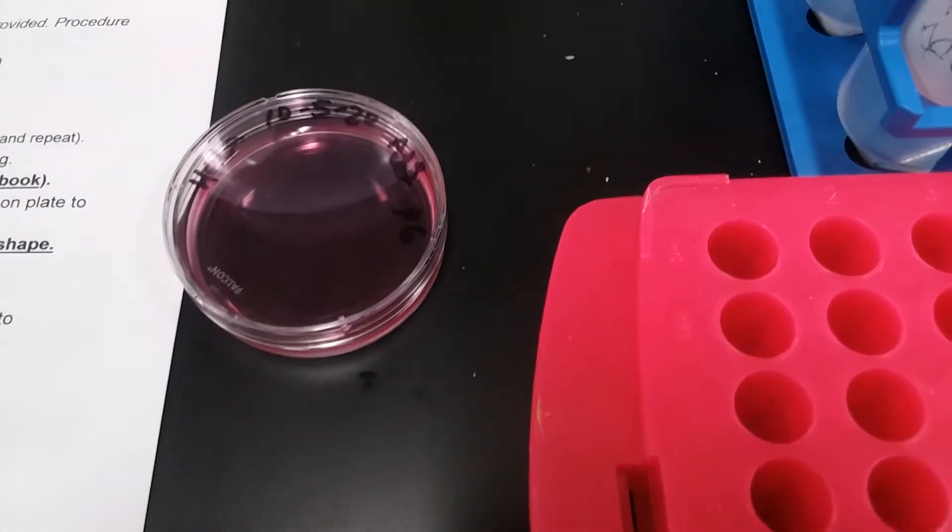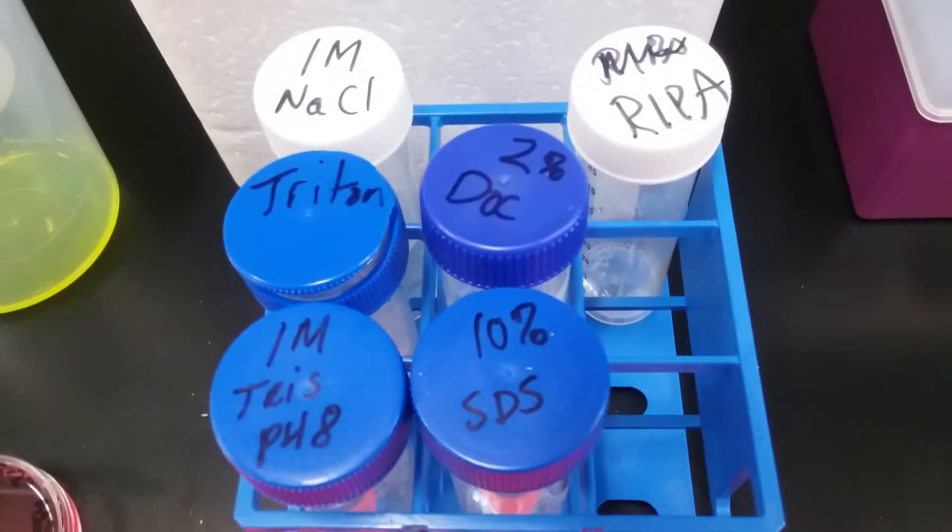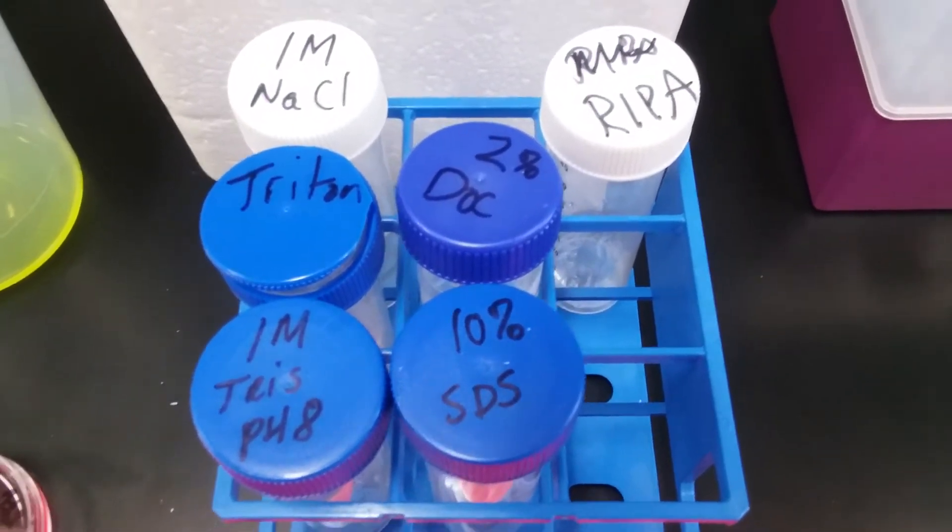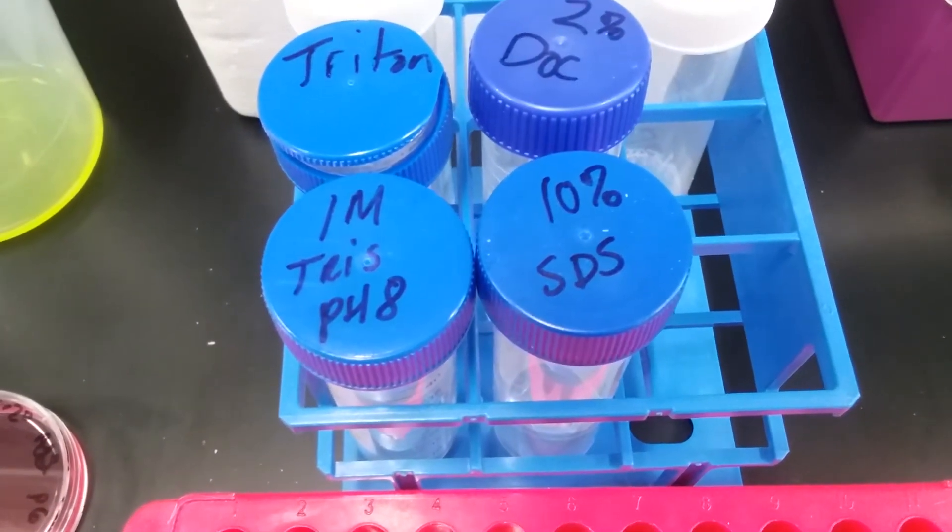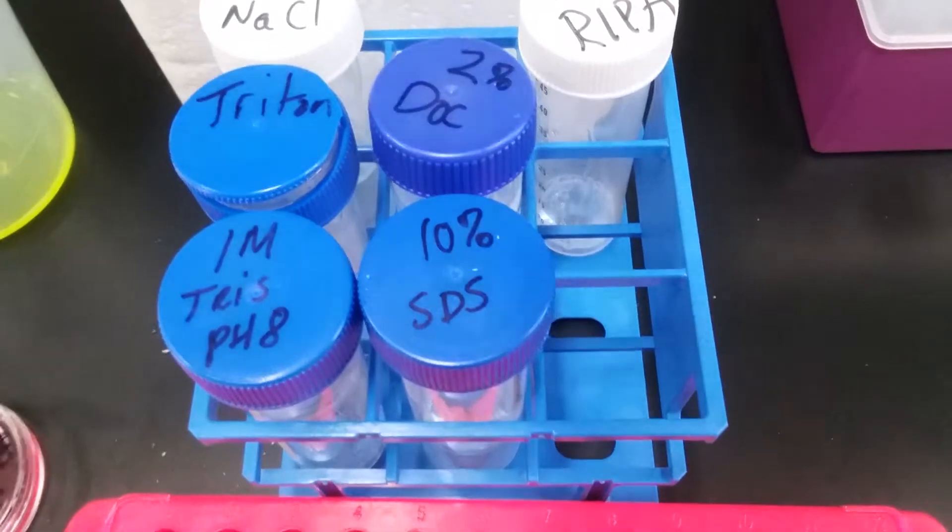We're going to be making a whole cell lysate from our HeLa. In order to accomplish that, we're going to make something called a RIPA buffer using Tris, which is a buffer that'll keep everything in a nice pH of 8, and three detergents.